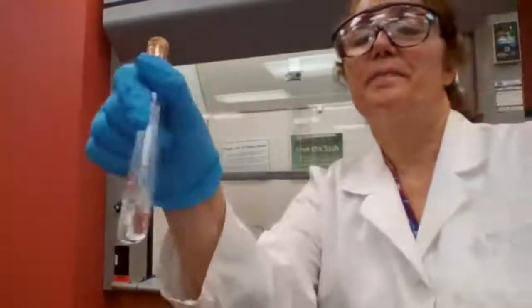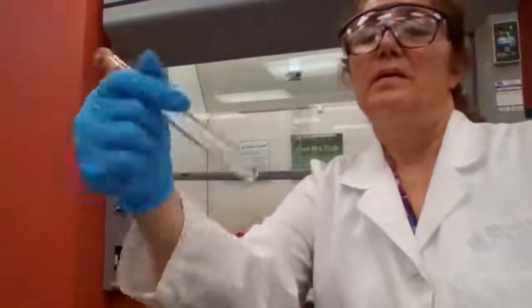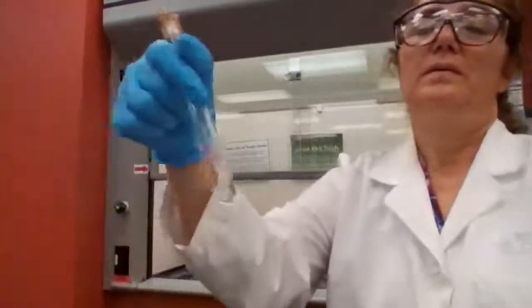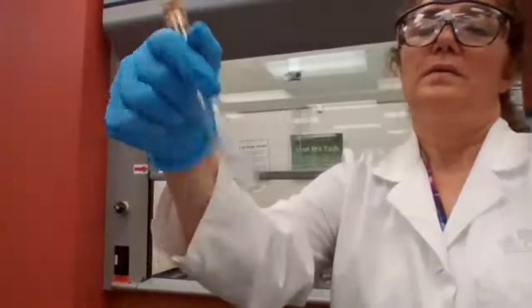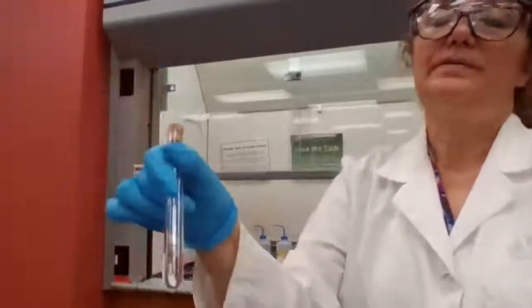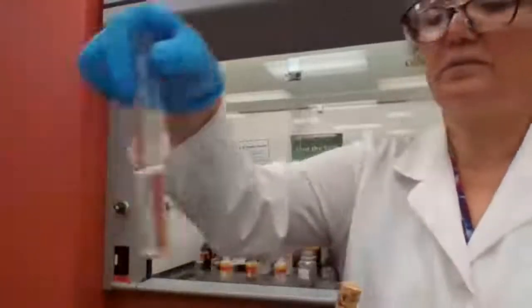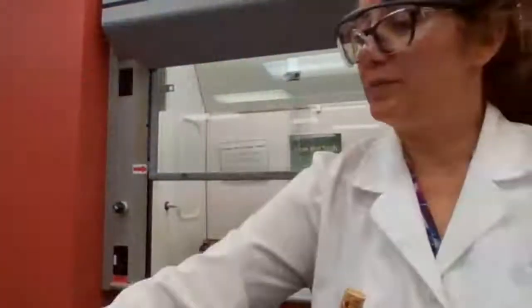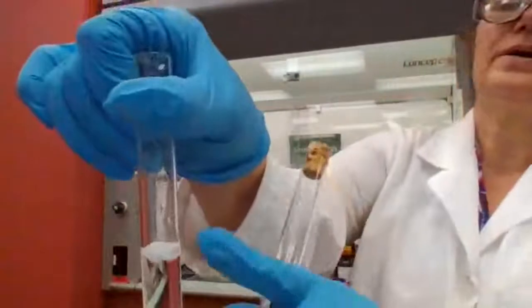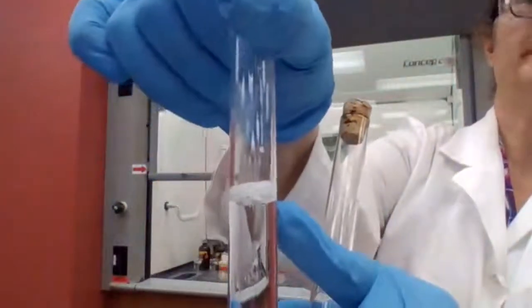What would be the next step? I finished the solubilities. It was solubility in water, solubility in sodium hydroxide, and then solubility in sodium bicarbonate where I showed you the bubbles.